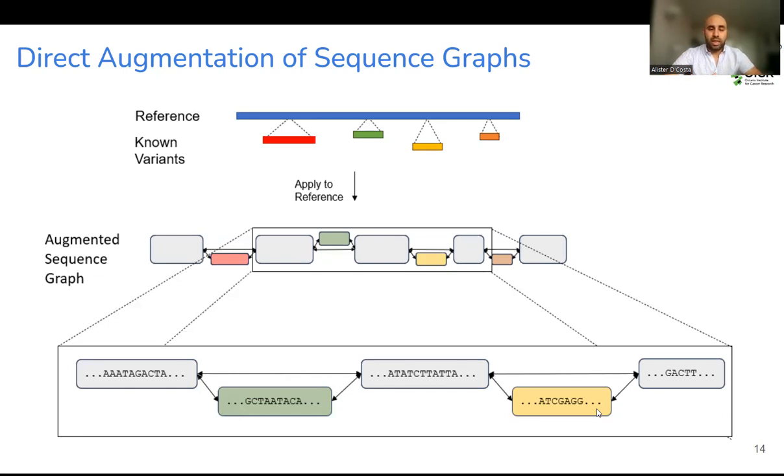And we can look at the paths that those alignments take. As this graph contains variants that are known to that individual's normal, any variants that are unique to the tumor would show up here as, say, split alignments for translocations, but any variants that are shared between the tumor and the normal, the reads would just align through those paths for known variants.